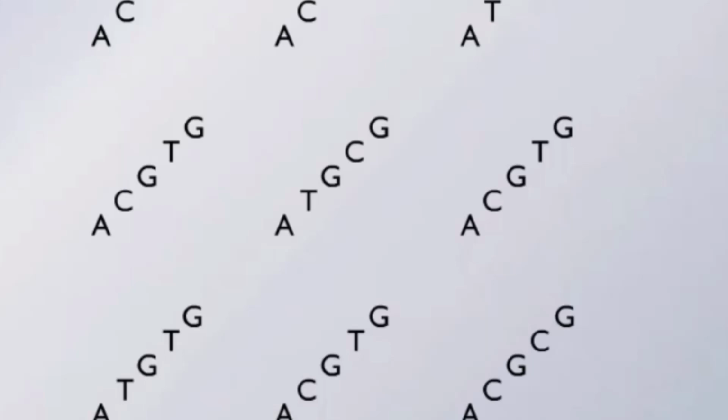An array or DNA chip is a special array of oligonucleotide probes closely arranged on a small solid support surface. The oligonucleotide probes represent the nucleotide sequence in known genes and are synthesized on the solid surface in such a way that both the position and the nucleotide sequence of each probe is known. Microarrays can be used to identify organisms and the specific gene by hybridization of DNA from the organism to the oligonucleotide probes in the microarray.